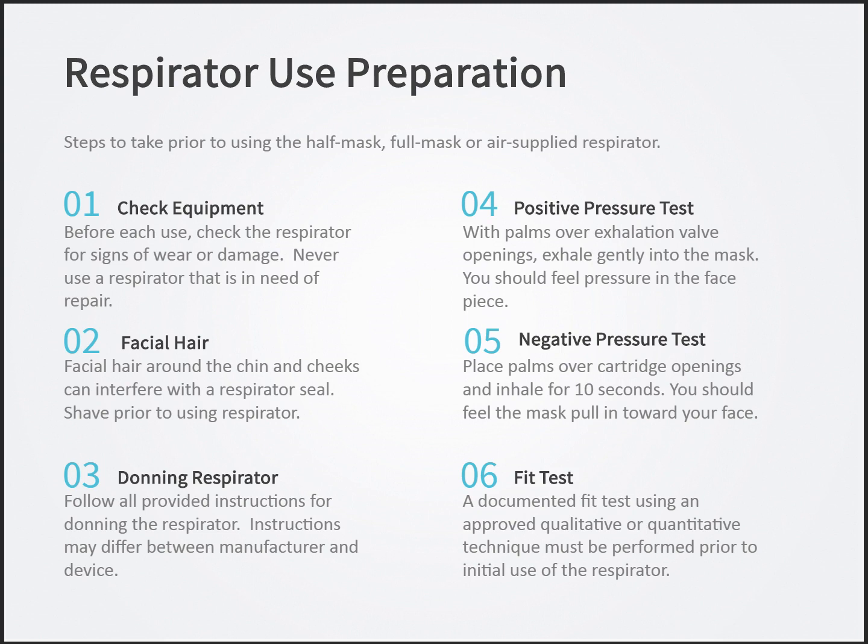Perform a positive pressure test. With palms over exhalation valve openings, exhale gently into the mask. You should feel pressure in the facepiece. Perform a negative pressure test. Place palms over the cartridge openings and inhale for 10 seconds. You should feel the mask pull in toward your face. And finally, the fit test. A documented fit test using an approved qualitative or quantitative technique must be performed prior to the initial use of the respirator.